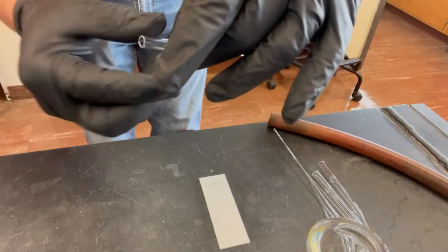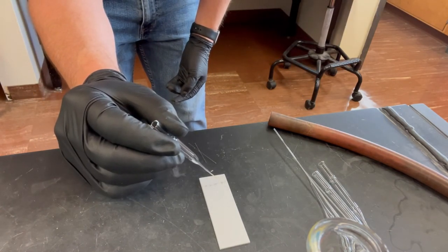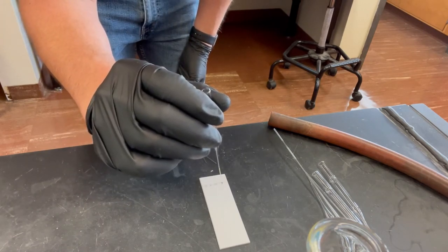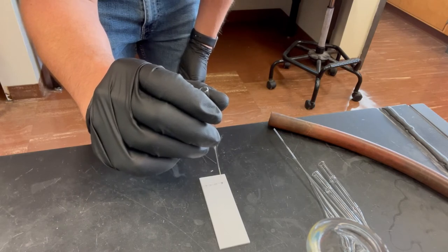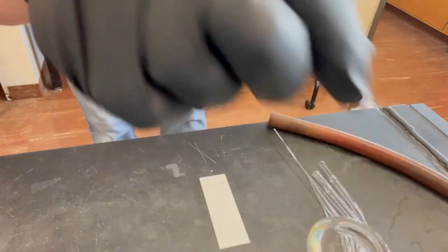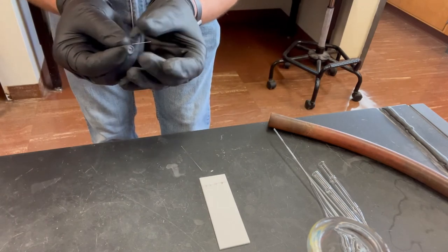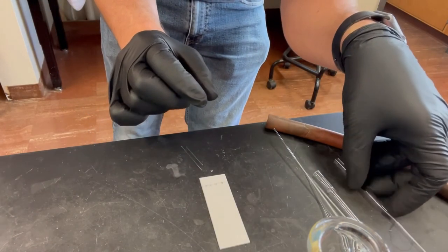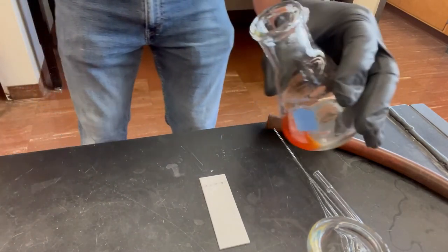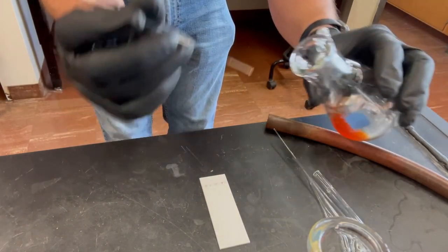The good sample was on the left side, so I'm going to put this, the filtrate for the good sample, on the left side of the dots. 1, 2, 3, 4, 5, 6 probably, just because that seems dark and very concentrated. Okay. I'm not sure this is going to work. Let's go with this guy, right here, in order to get inside of this flask. I could have poured it into something else, but why? Then I've got to clean more glassware. Ooh, that's going to be too much.